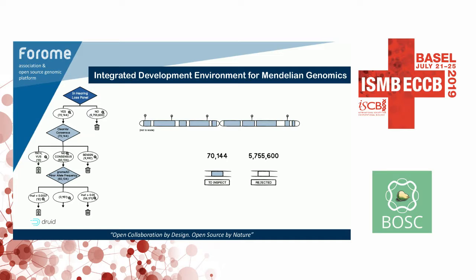As I said, we use Anfisa as an environment to develop new clinical rules. And we represent clinical rules as a decision tree to select variants for a manual review by molecular geneticists. And as a development environment, it should support various things. So first of all, the code is written in Python in a similar way like you use Jupyter notebooks. And then you have a step-by-step debugger where you can see what actually happens with your variants while they're analyzed.